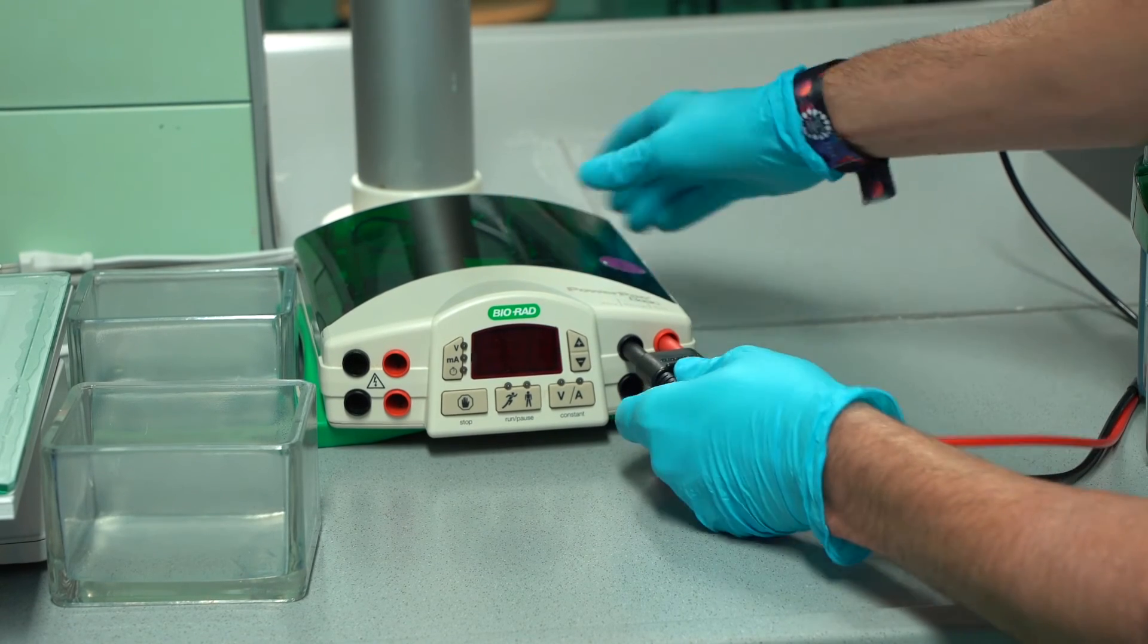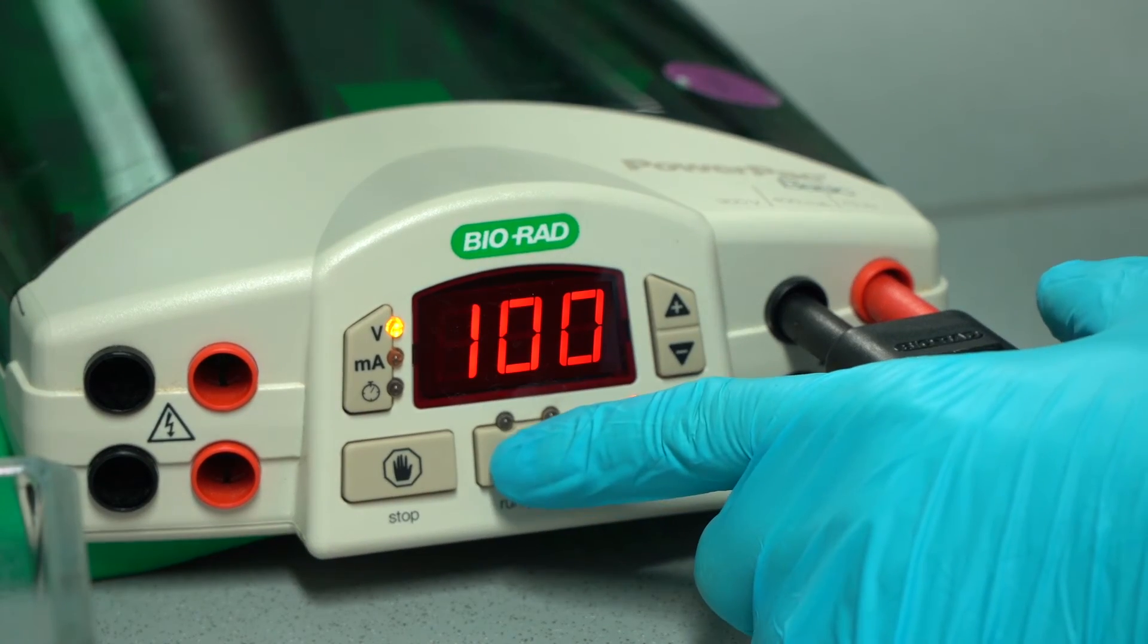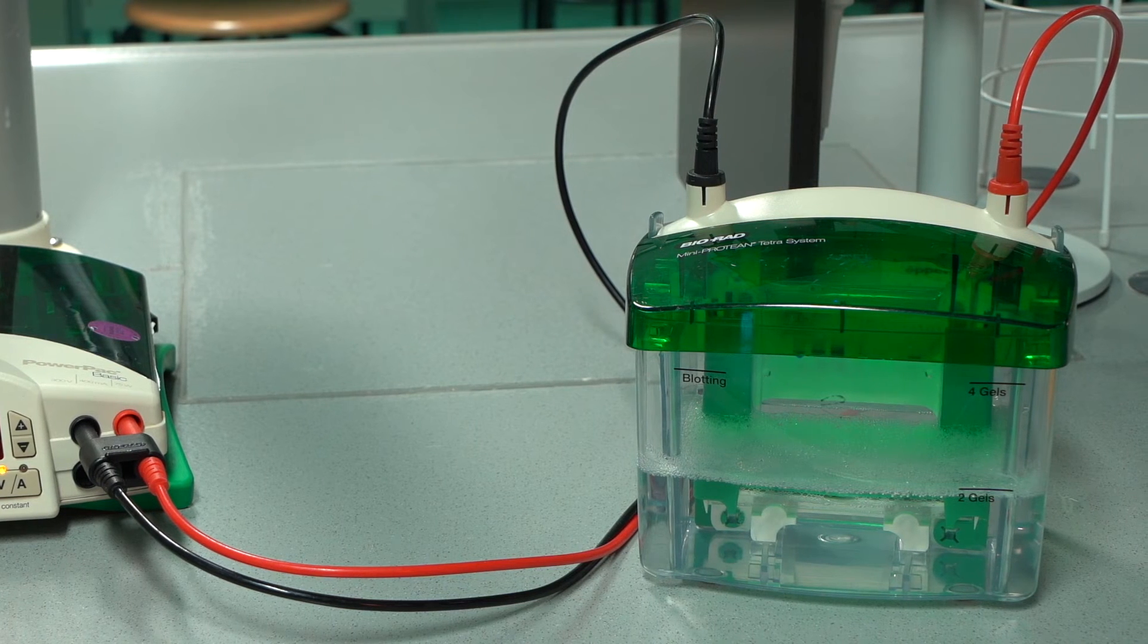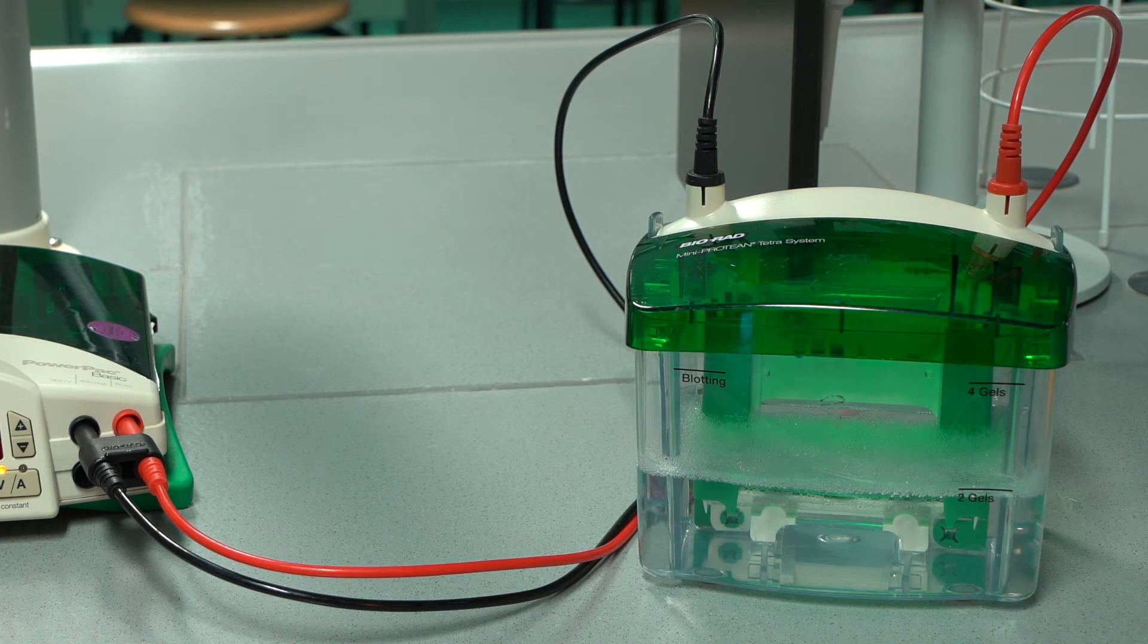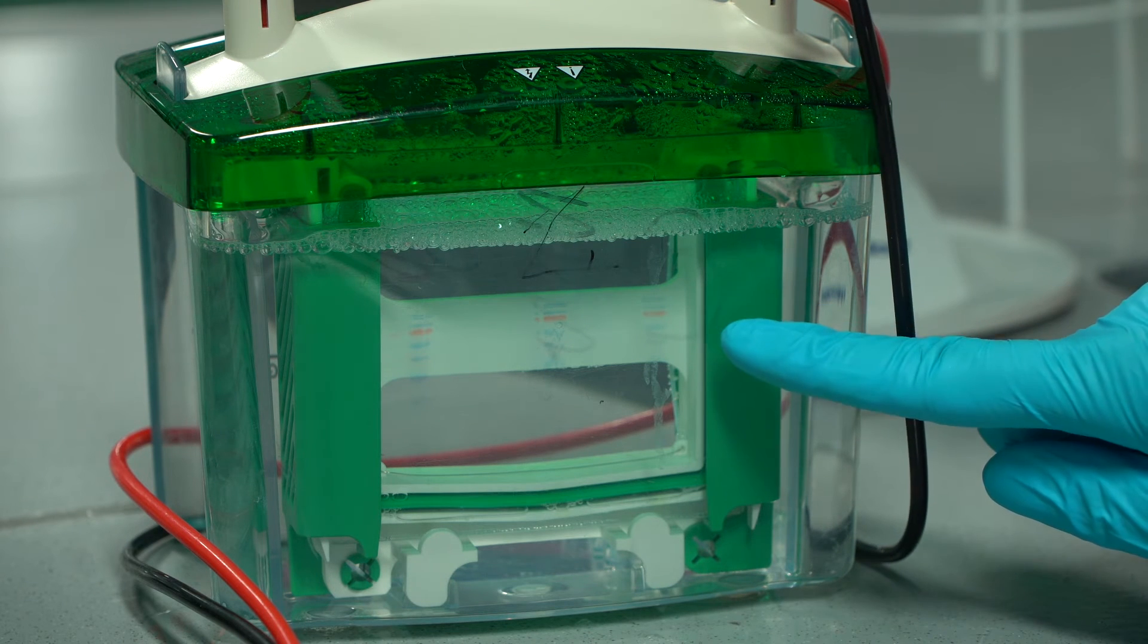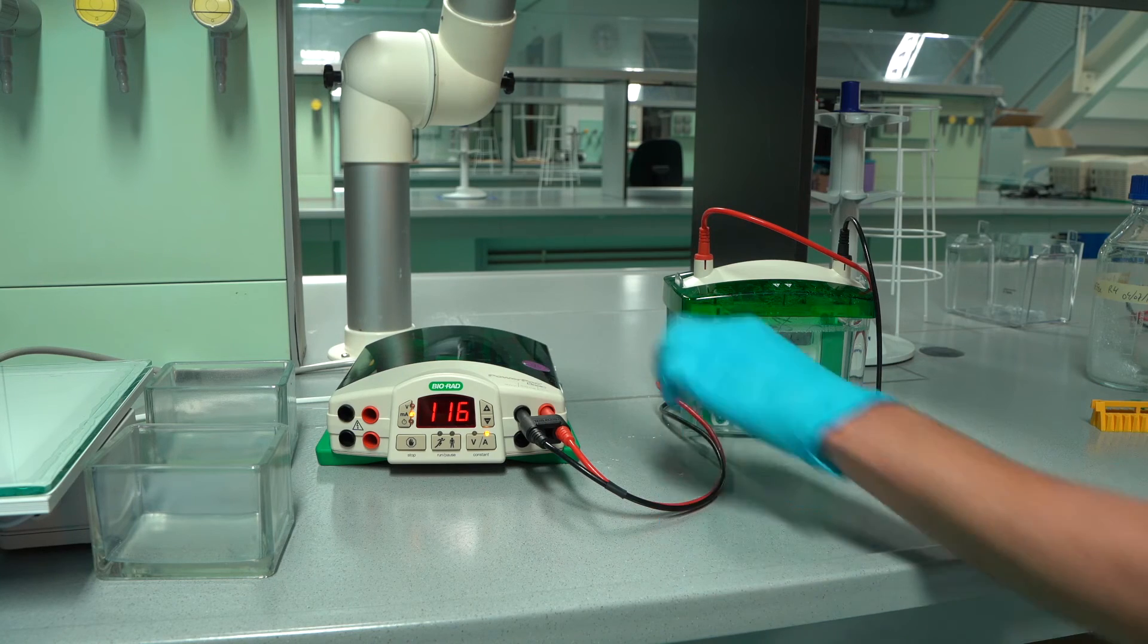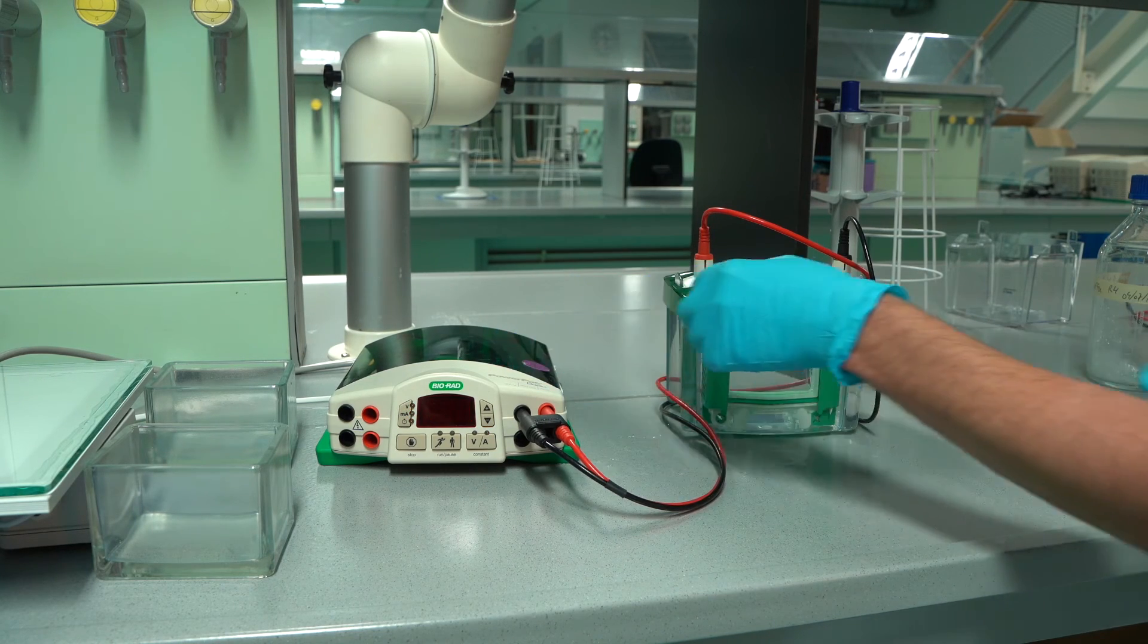Connect the power cords to the power supply. Run the gel on 100 volts until the samples are completely in the stacking gel. From then on, the gel can continue to run at 150 to 200 volts. Check the ladder to see if the separation has completed, or when the dye has reached a centimeter from the bottom of the gel. When it has, you can switch off the power supply.